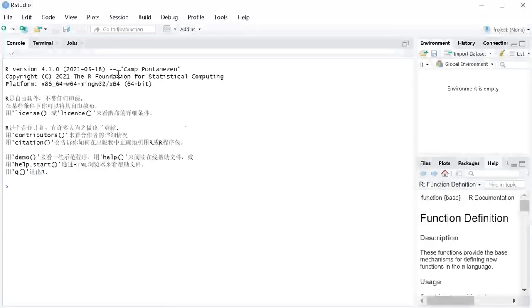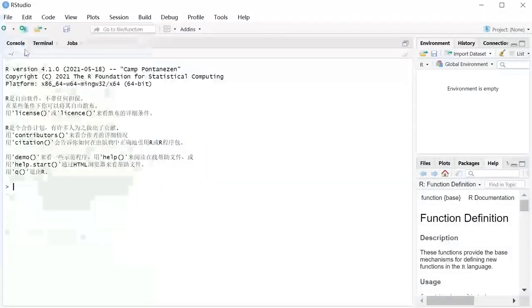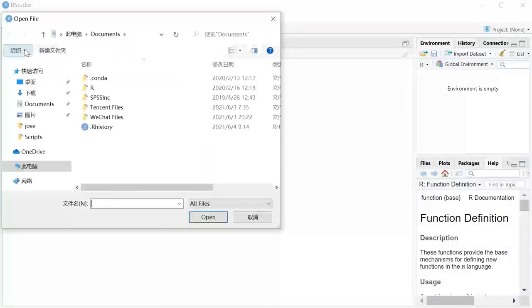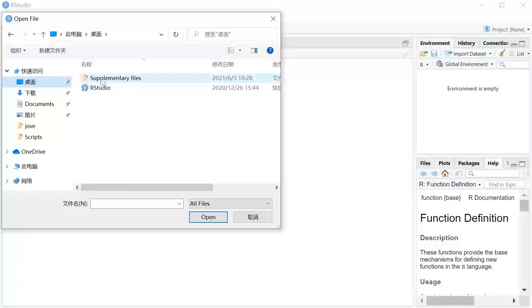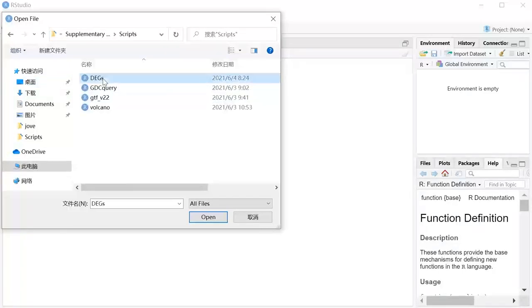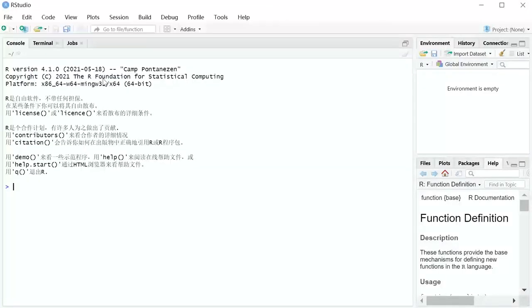Open the RStudio program and load the R file. The file can be acquired from supplementary files.